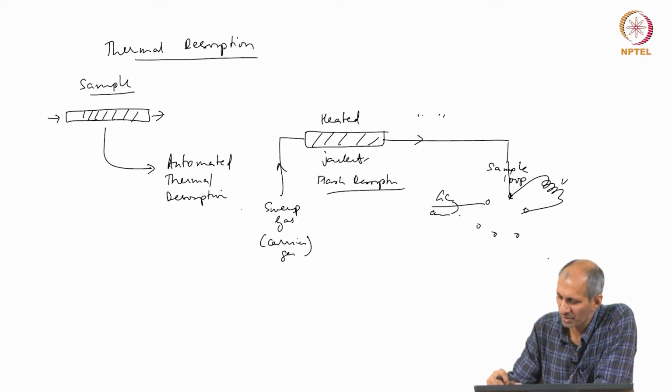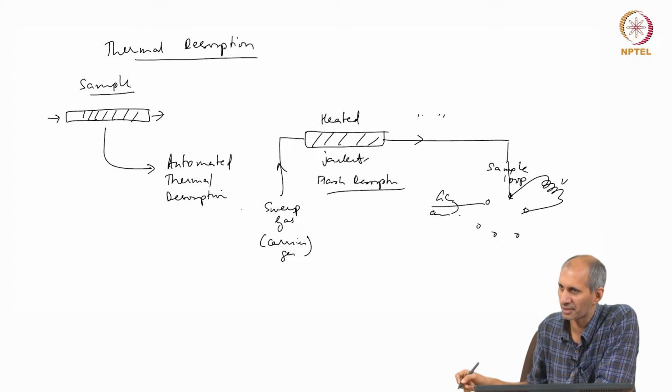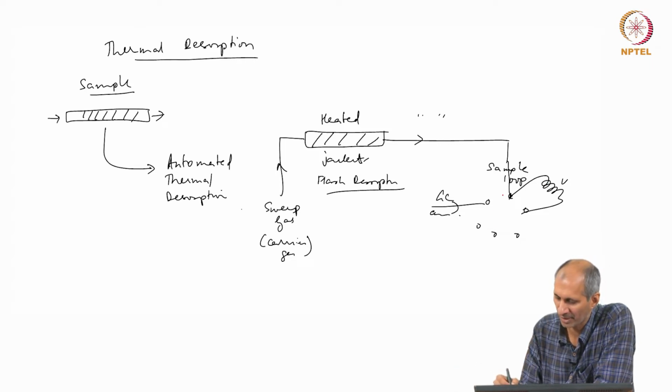What happens is that there is a certain configuration called the loading cycle. When you switch, this carrier gas will take the sample loop contents and go to the GC. So, that is what will happen. I am not drawing it here, but it is called a rotary valve.